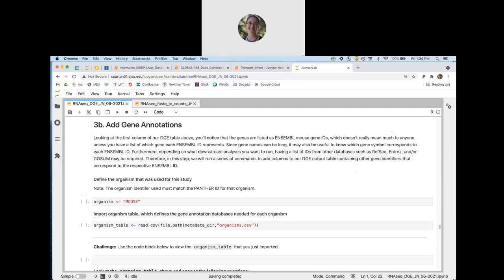Did we already account for all the duplicated reads somehow or later? Amanda, were you going to say something? Well, I was just going to ask for clarification from Felix. Are you talking about the multiple gene IDs that map to the same gene symbol?